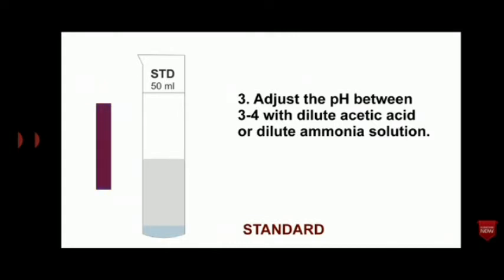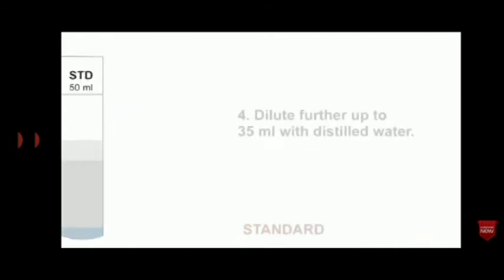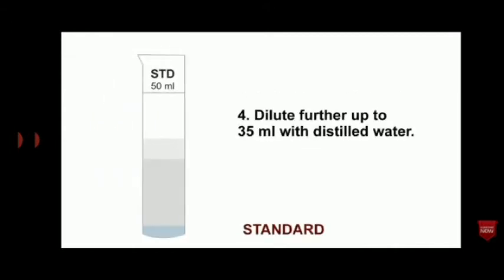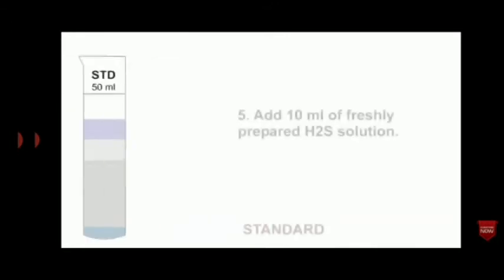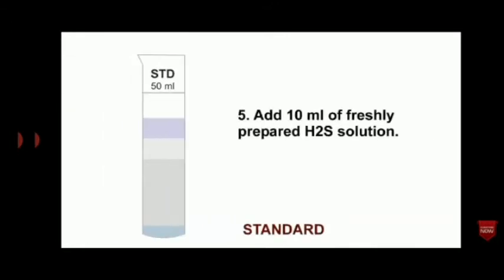The reagents used in this case are labeled as SP, that means lead free. Dilute further up to 35 ml with distilled water. This is then followed by the addition of 10 ml of freshly prepared hydrogen sulfide solution.